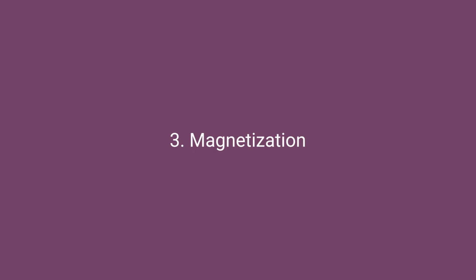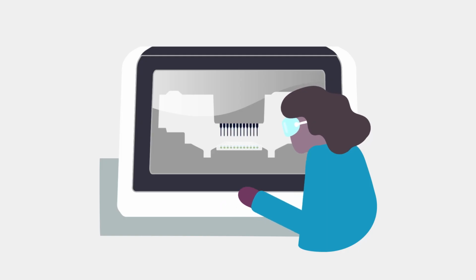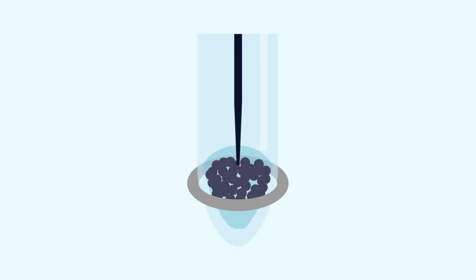Immobilizing the magnetic beads is controlled by 3 parameters: the position of the magnets, the amount of magnetic field applied, and the quantity and size of magnetic particles. Watch the beads during this step. Make sure they're fully collected. Magnetizing the post for 1 to 3 minutes is typically enough. If you are using a ring magnet, make sure there's a clear gap in the center of the well for the pipette. If there is not a clear path for the pipette to the bottom of the well, reduce the number of beads in your extraction.